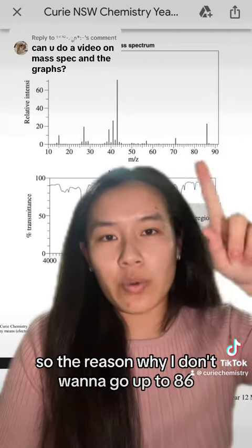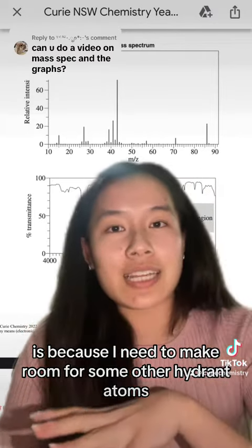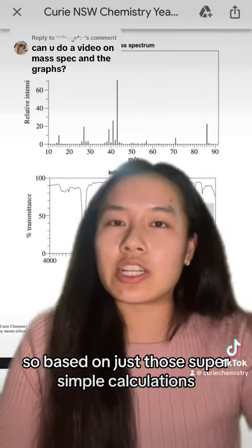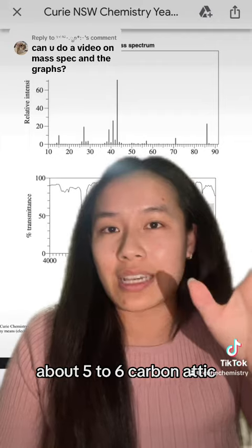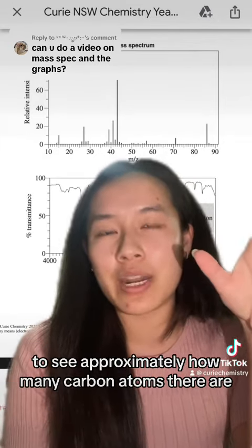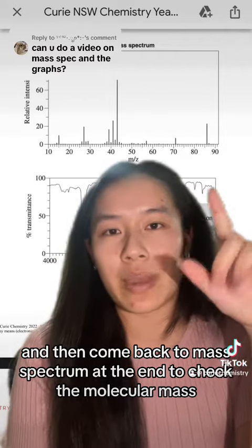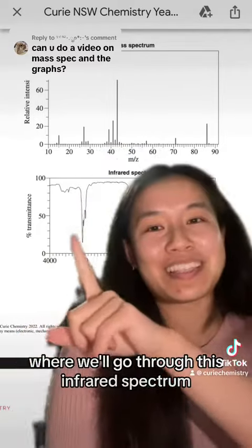The reason why I don't want to go up to 86 is because I need to make room for some other hydrogen atoms as well as maybe some oxygen atoms that might be in my molecule as well. So based on just those super simple calculations, I'm expecting my molecule to have about 5 to 6 carbon atoms. So check your mass spectrum at the start to see approximately how many carbon atoms there are, but don't spend too long on it. Figure out the structure using the other graphs and then come back to mass spectrum at the end to check the molecular mass. Watch out for part 2 where we'll go through this infrared spectrum.